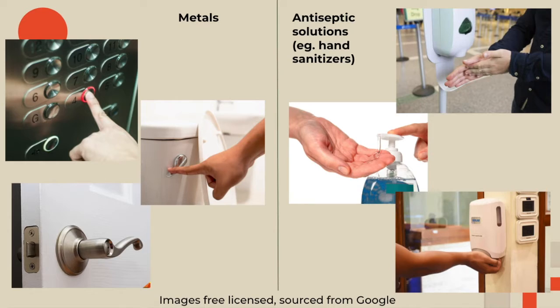During the pandemic, there was also a large increase in the use of hand sanitizers and various antiseptic solutions. Thus, I wanted to investigate which solutions were the most effective and should be used in place of others. Furthermore, I wanted to test the claims that certain brands make of killing 99% of bacteria on bacterial strains that I tested on myself.